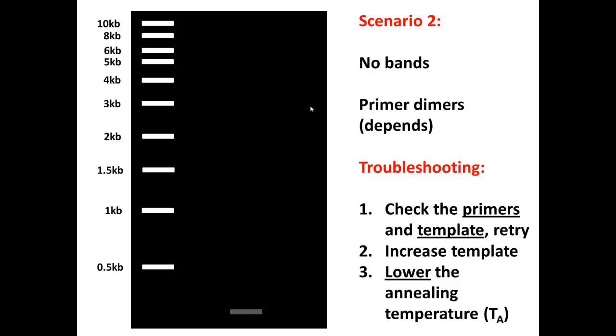Let's look at scenario two. We get no bands, nothing at all, maybe some primer dimers, but that's about it. What I suggest is that number one, you want to go ahead and check your primers and templates and you want to retry your experiment. If that doesn't work, maybe you can try increasing the template, your DNA template. Maybe you just don't have enough DNA. I personally usually use around 10 nanograms when I'm using my plasmids as my templates. Now if it still fails, you can try lowering the annealing temperature because the annealing temperature that you're using right now may just be too high for your primers to stably bind to your template. So lowering it will promote binding.